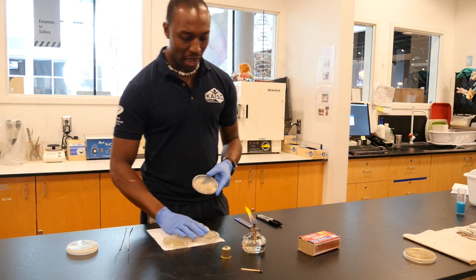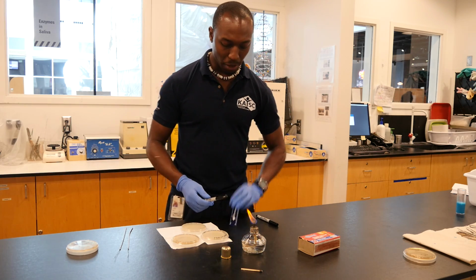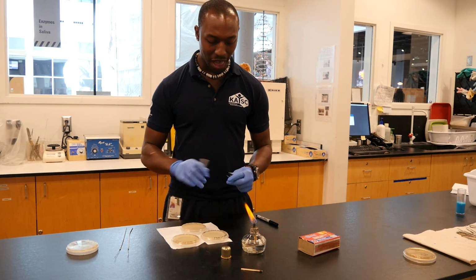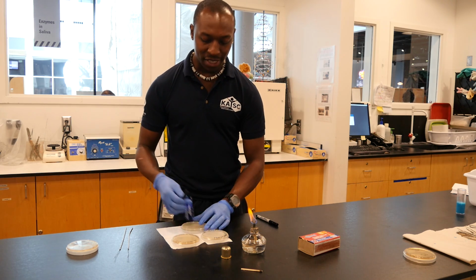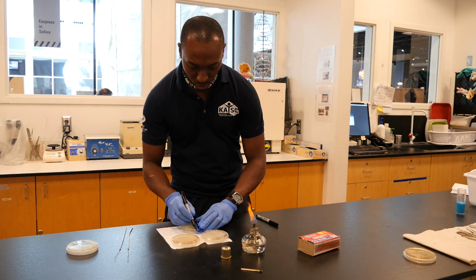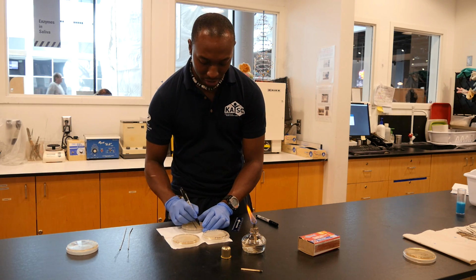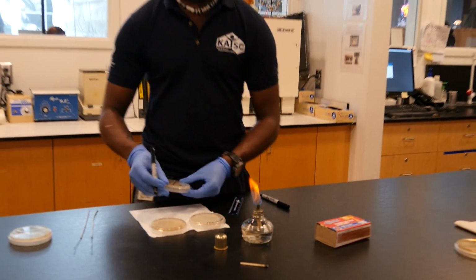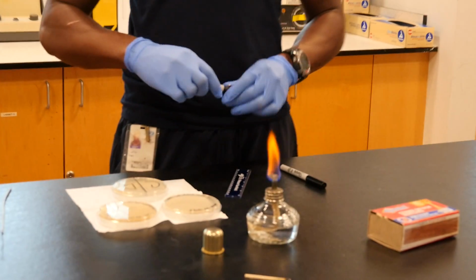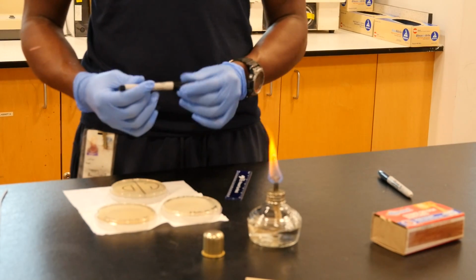I'm going to use my agar plate, and I'm going to use my ruler and my marker to make a line across the whole plate, and make sure that it's on the agar side, okay? Once I do that, I'm going to write the letters. I'm going to have a C and a D, just like that, okay? Once I do that, the thick marker is now done. We don't need that anymore. Get the fine marker, okay?